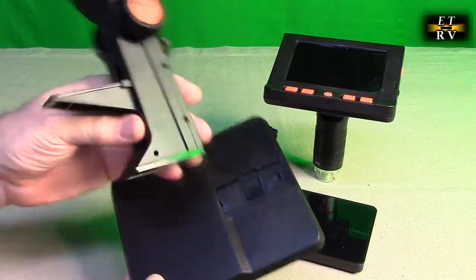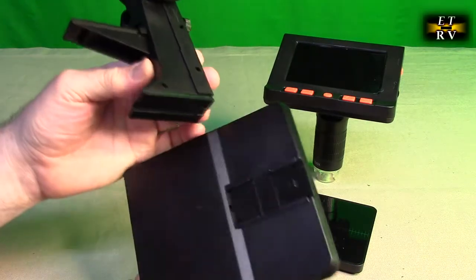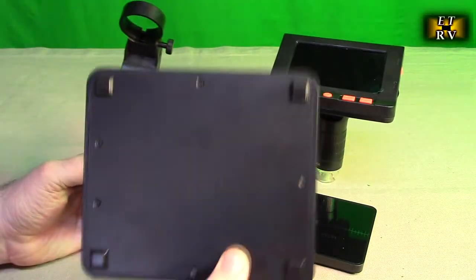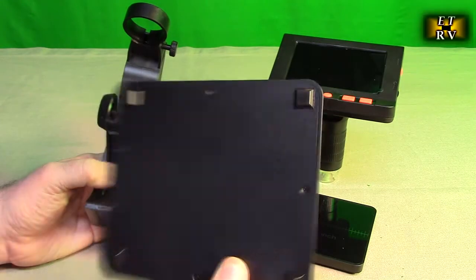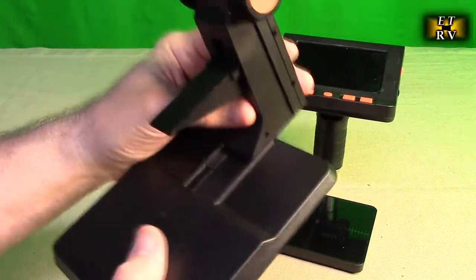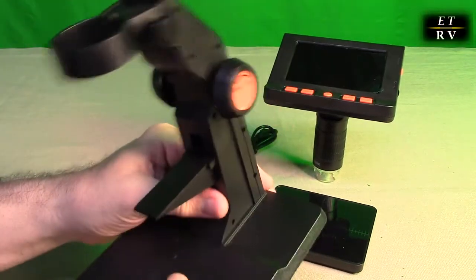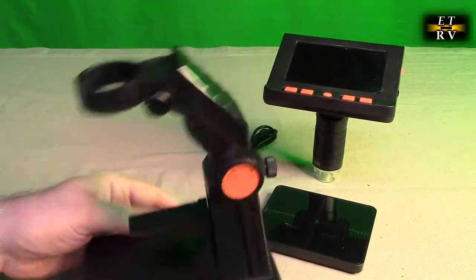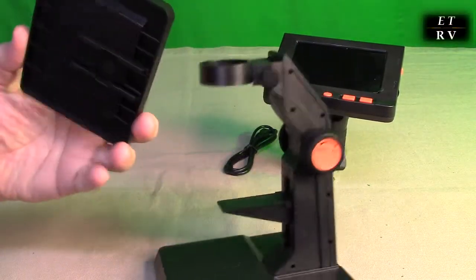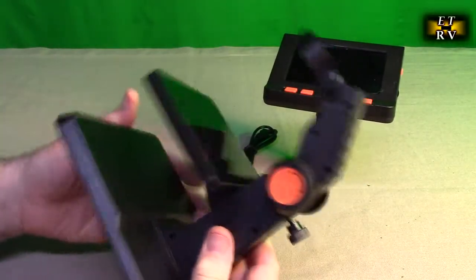The first thing I'm going to do is take the up-and-down mechanism and the holding mechanism. Here is the bottom plate which is weighted nicely and has four rubberized silicone feet on there, which allows this to stay nice and stable. We're going to slide this in place — you hear that lock right there. Now we have this up-and-down table and that slides and locks in place also.